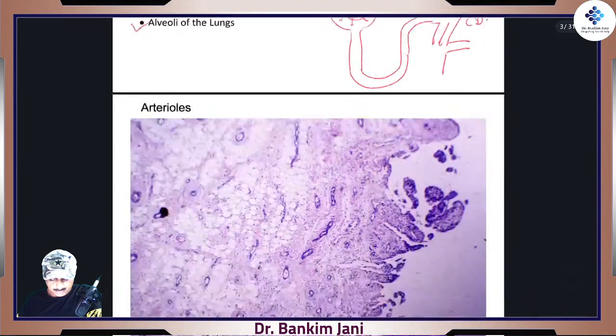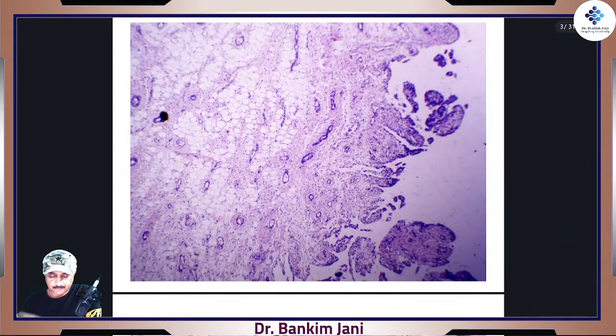The first one coming up, arteriole. See, when this image is given, arteriole, right, it looks like, where are the arterioles? Because this is a tissue, a section is taken. This is because it is just 10x. It is just 10 times magnified, right? We are watching these areas. Watch for it.